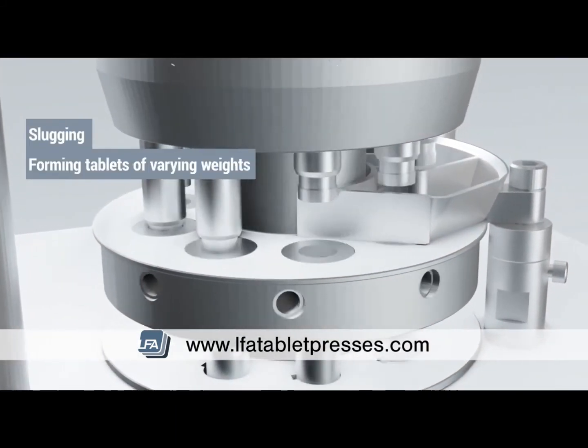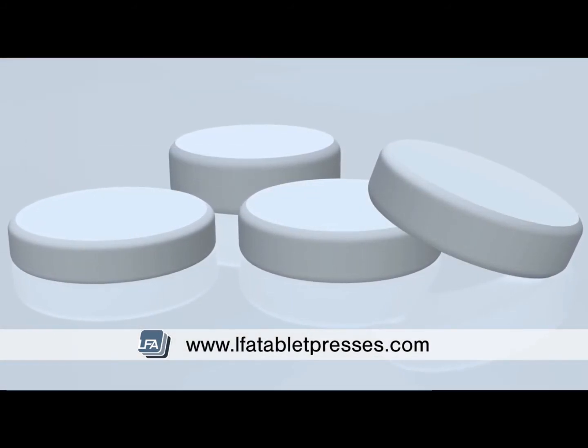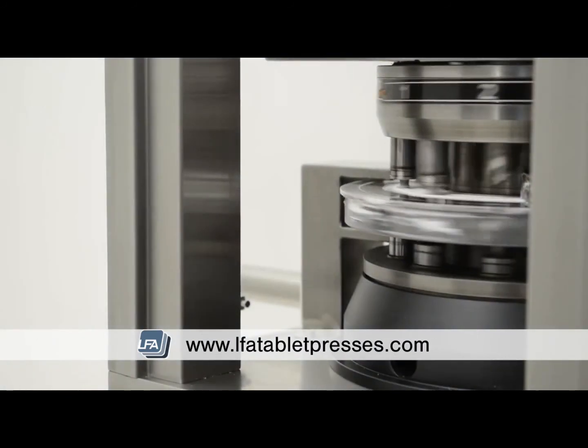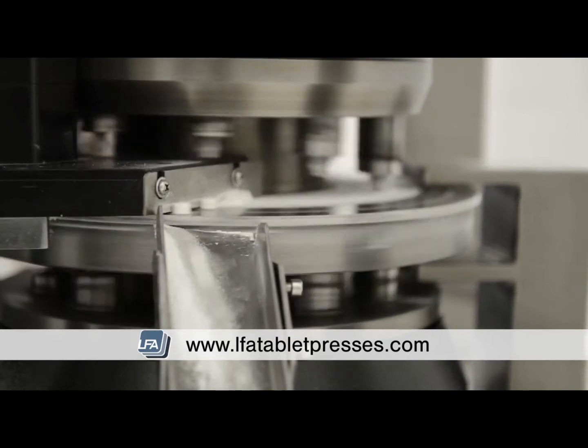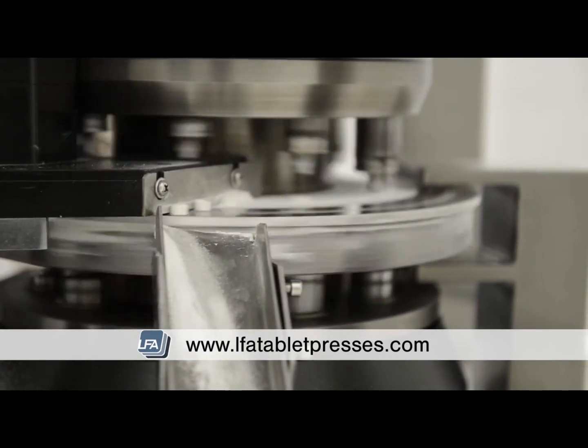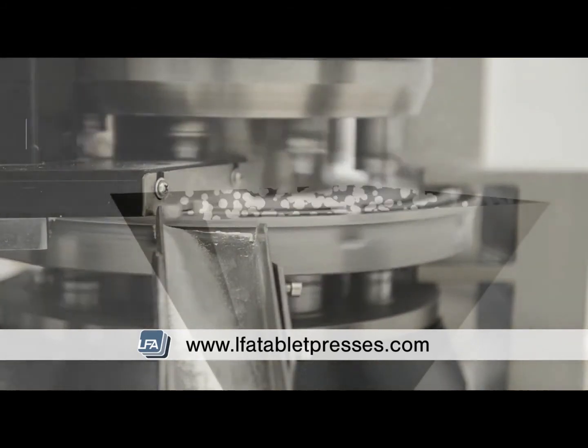Let's look at slugging, which is used in your tablet press to form large tablets that vary in weight due to poor flowability of the formulation. The slugs created are then put through your granulator to be broken down into granules and then compressed once again for your final tablets.